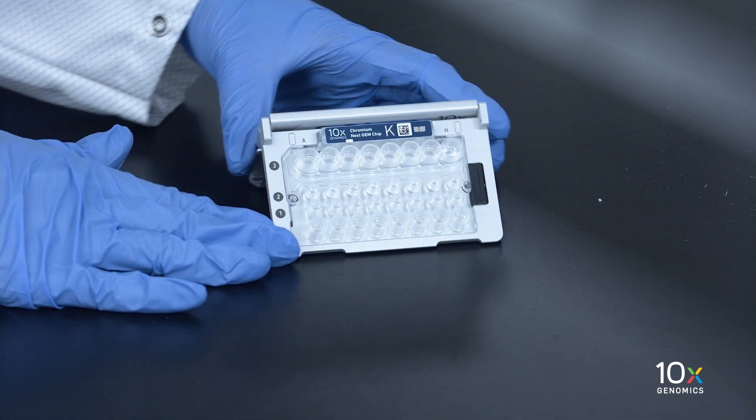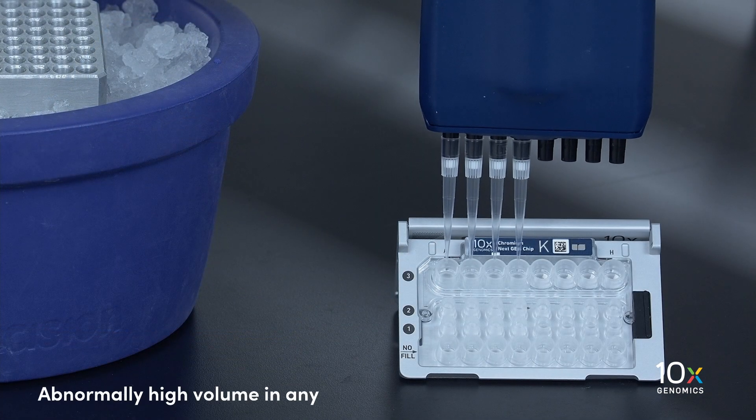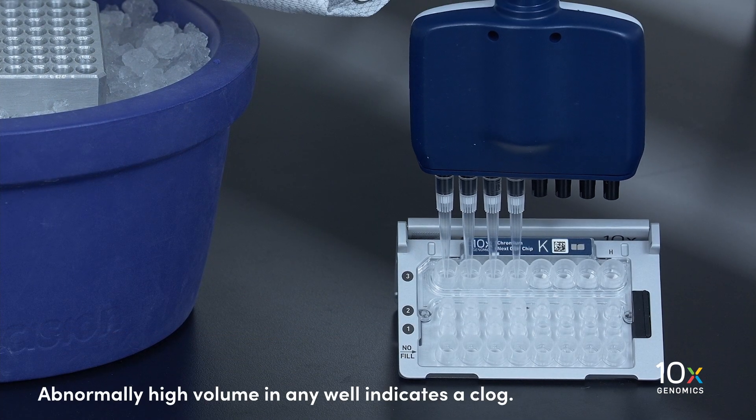Check the volume in rows labeled 1, 2, and 3. Abnormally high volume in any well indicates a clog.